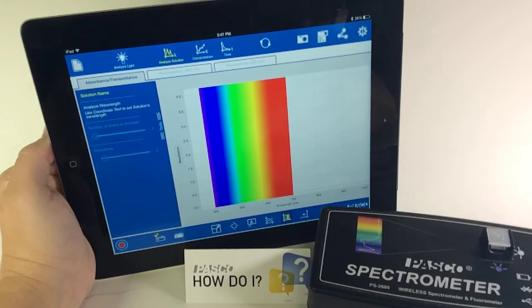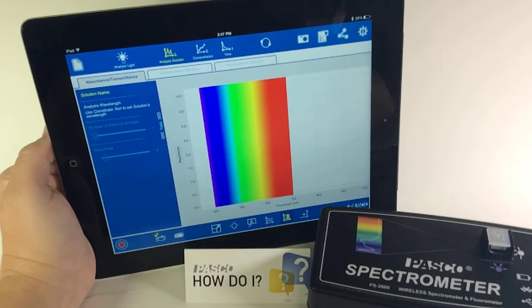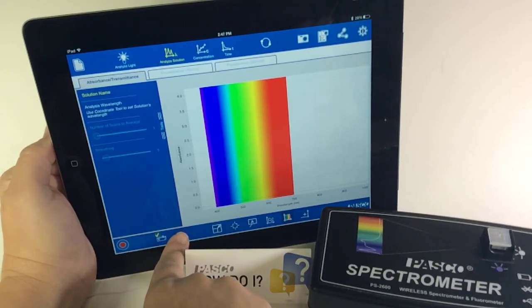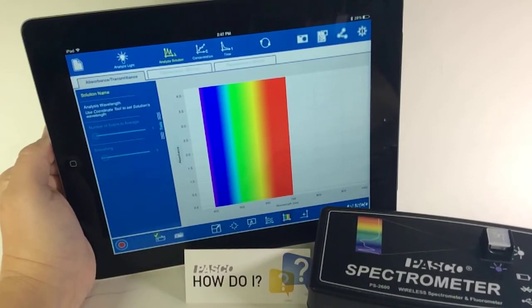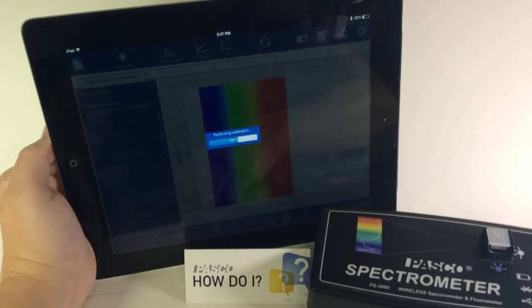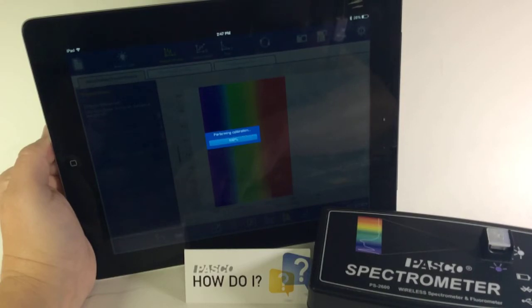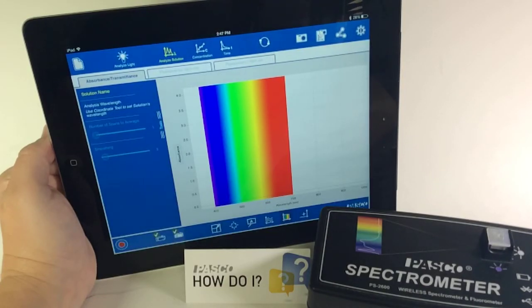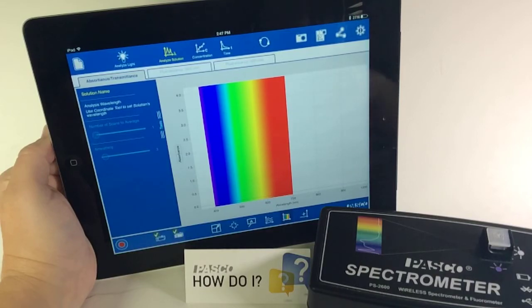Following a short warmup period, you can hit Calibrate Reference next to Calibrate Dark, and it's calibrating to the reference solution that I have in the spectrometer, which again is just water. And now that it is calibrated.